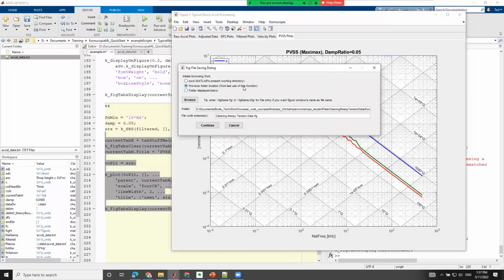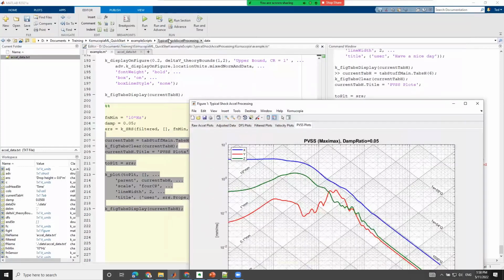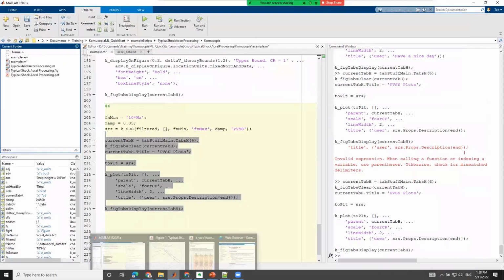This pop-up occurs. You need to basically be specifying a folder and the name. By default, it remembers the last place you would save data. So we want to save this in our working folder. So I'm actually going to cancel this because the working folder is not what I want it to be. Working folder should be here. So now I will save this.